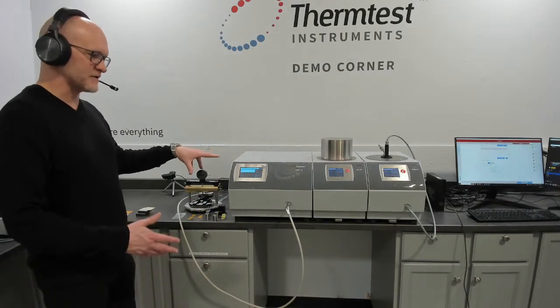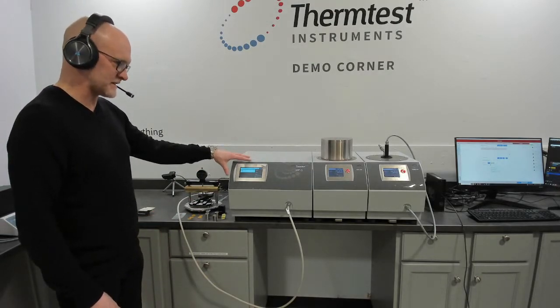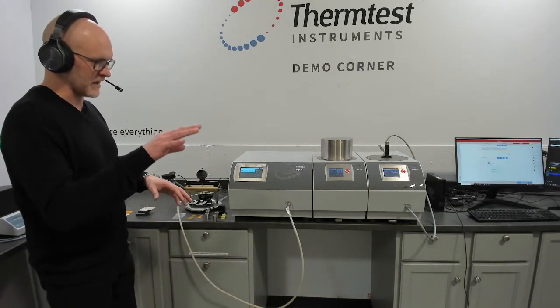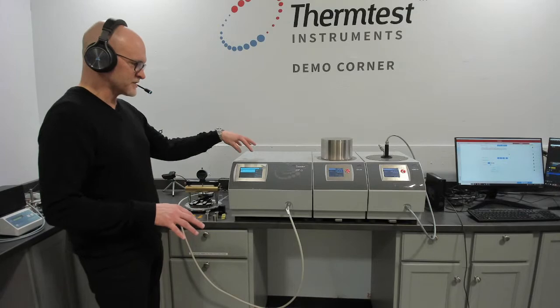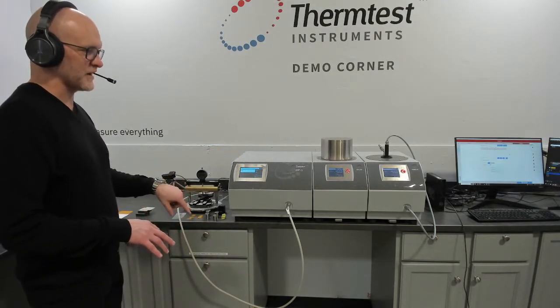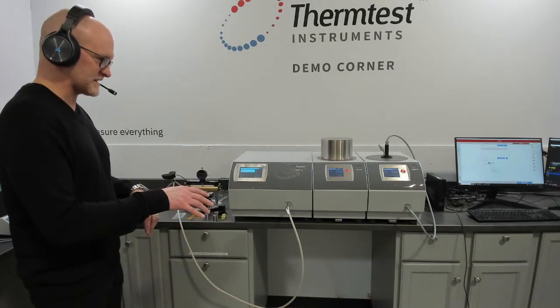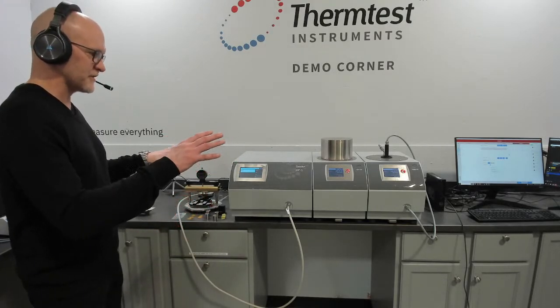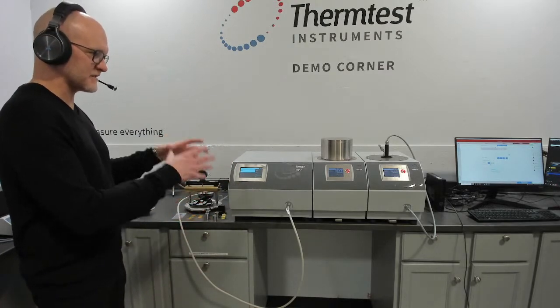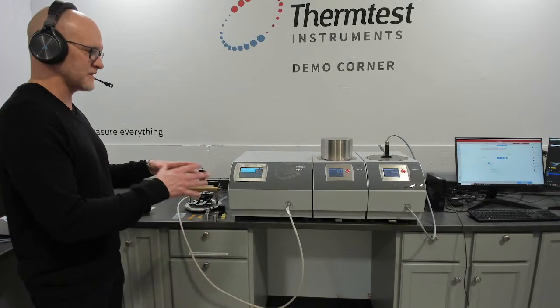The transient plane source method inside the MP1 has an overall connectivity range of 0.005 up to 2000 watts per meter Kelvin. What allows us to do that is having the available test times to accommodate reasonably sized sensors of those high conductivity diffusivity materials. So the MP1 TPS method has the shortest test time of 0.25 seconds all the way up to 2,560 seconds, which is a wide range of test times to accommodate different diffusivities in samples size scales.